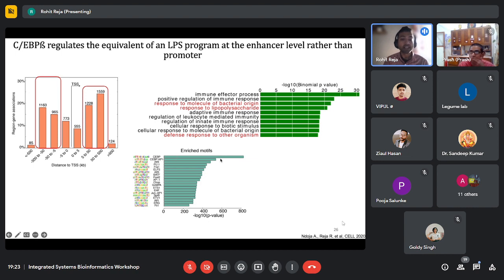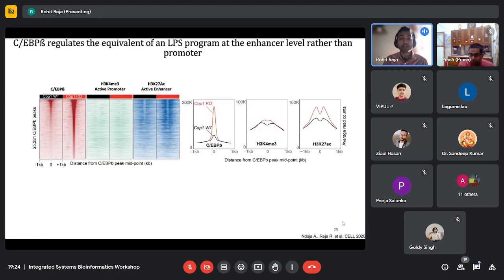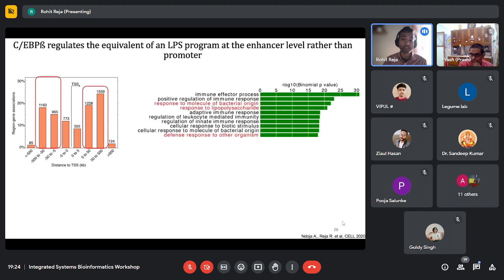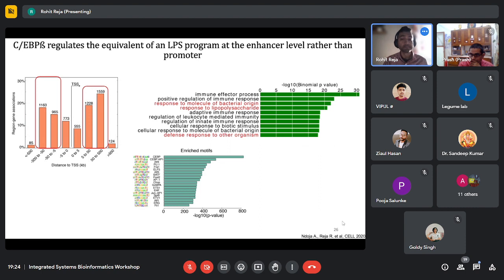And what I'm plotting here is just the minus log 10 of the enrichment p-value. It basically tells me what the different motifs are that are enriched. So this is an example of applying ChIP-seq data, ChIP-seq peaks, and basically once you have the peaks, I went on to look at what those peaks are, whether they're enhancer or promoter peaks, what is the function, and the motif. It really gives you insight about what the biology might be going on for this particular transcription factor.